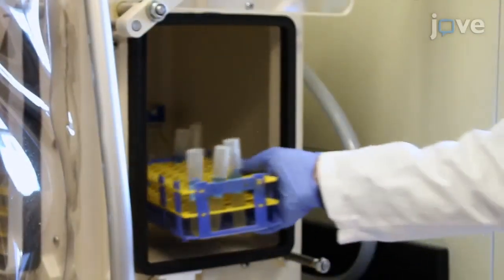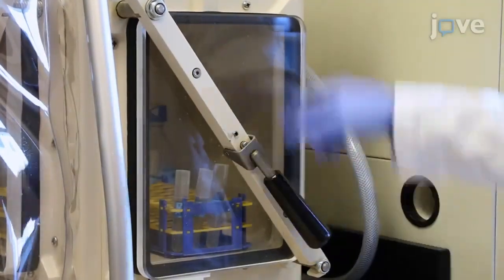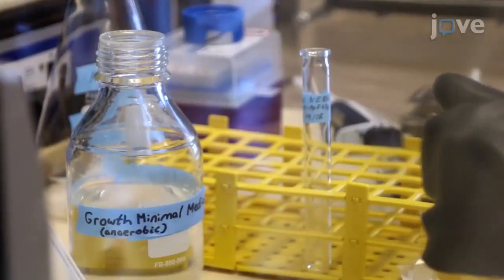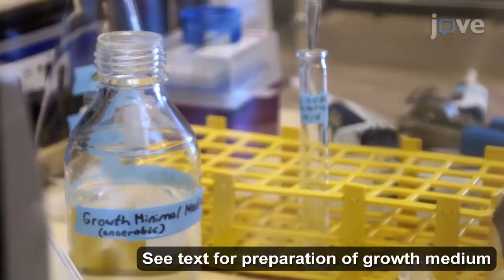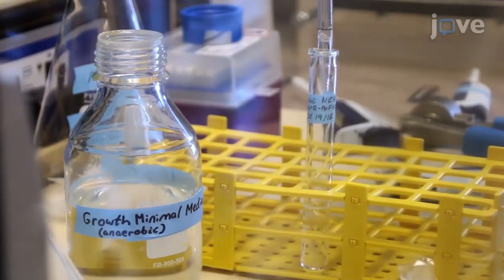At between 9 and 10 a.m. the next morning, bring the culture as well as the previously prepared growth medium into the anaerobic chamber. Then add 8 milliliters of fresh growth medium and 210 micrograms per milliliter of ampicillin into a sterile Balch tube.